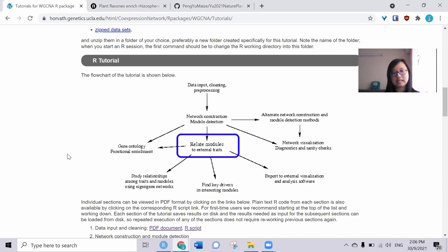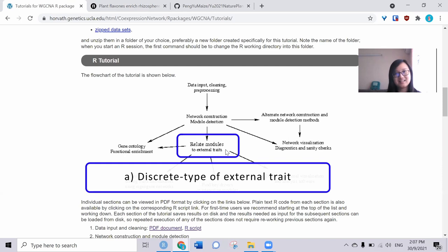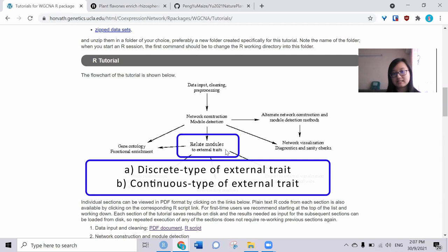The external trait here is divided into two types. First is discrete data, which is like female or male. The other is continuous data, like other expression data. For example, in the paper, it's the microbial profiling data.